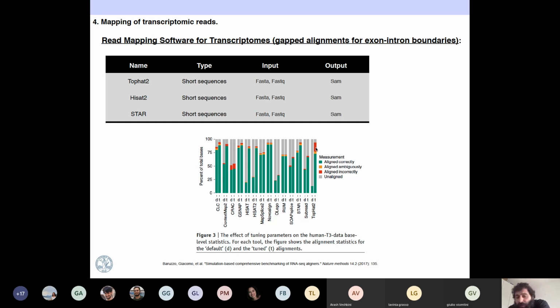So a good way to tune them is, for example, imagine that you are mapping Arabidopsis lyrata, that is a different species of the Arabidopsis genus, to Arabidopsis thaliana. You are mapping them and you get 80% of the reads. Then you may think, well, because I have some differences, maybe if I reduce the seed size, I will be able to increase the number of mapped reads. So that would be the experimental way to do it. I can increase sensitivity in order to see if I can get more.